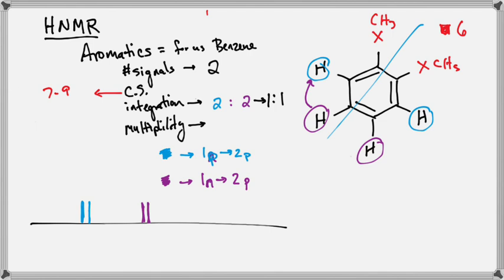And a potential hint to the question that you're asking about, let's be fair to everybody, you're asking about unknown number 10. What you are given is the reduced ratio, which doesn't give a whole lot away because that should be obvious when you look at your mass spec. Because the mass spec says you have a whole lot more hydrogens than your HNMR gives you. So the mass spec would feed you some information to help you decide whether you were given a reduced ratio or the absolute ratio. Kind of make sense?